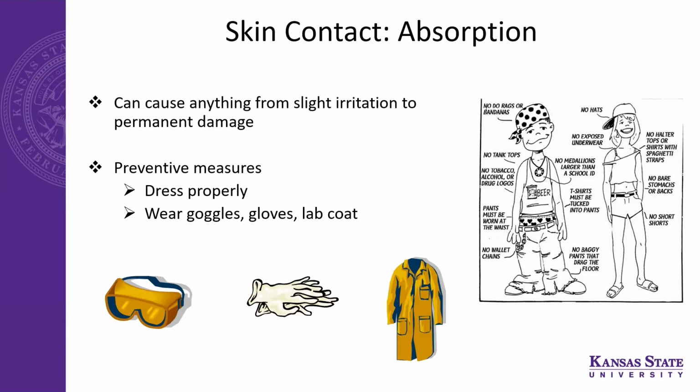In our labs, we have the unique opportunity that each student gets a drawer. So we encourage them to have long pants in that drawer, so that in case they come in shorts, they don't need to go back. They can just go to a restroom and change into their long pants, and then have the lab coat on top of that to protect you from contaminations. Are we good on that?